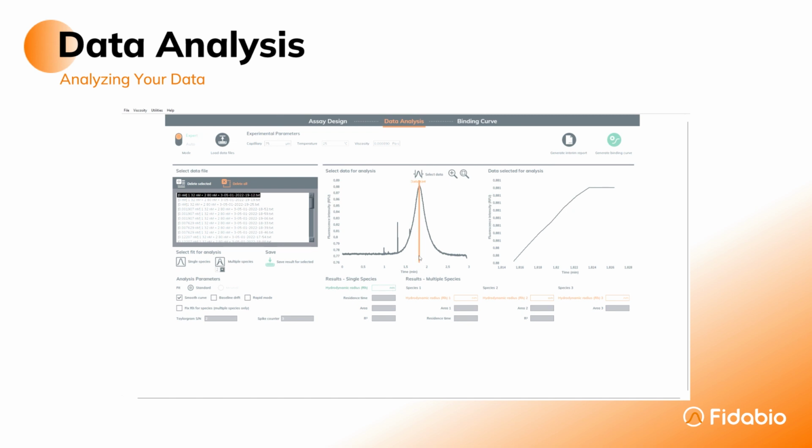You select the time interval that will be fitted by selecting Data Start and Data End. If the baseline is drifting, this can be fixed by toggling the relevant tick. The noise reduction can also be toggled on and off. You fit your data by clicking single species or multi-species.